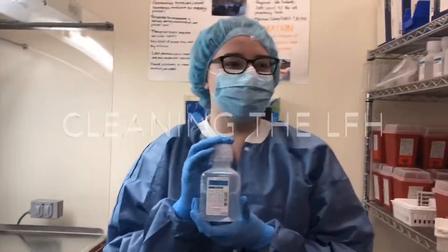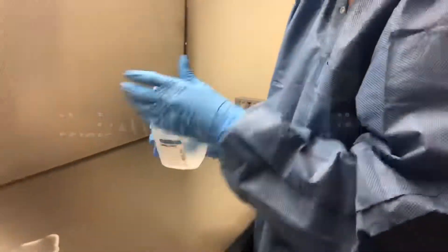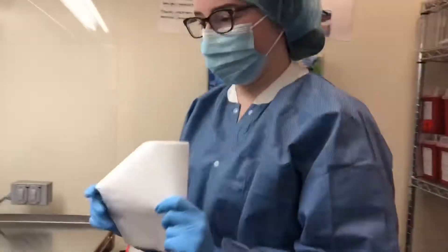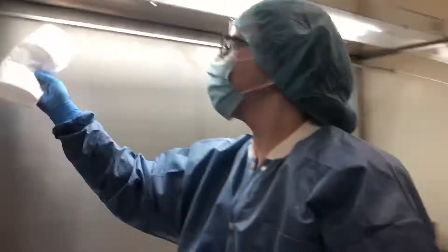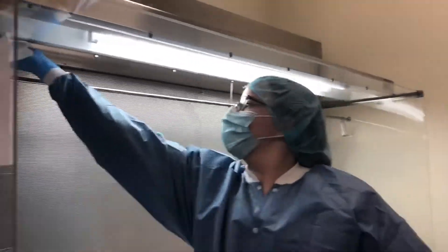To clean the hood, first grab sterile water. Make a puddle that will be absorbed by the lint-free towels. Start at the top of the hood and only wipe one way, which is horizontally.